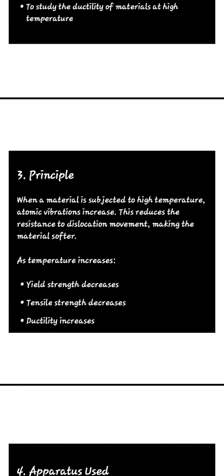Principle of hot tensile testing. When a material is subjected to high temperature, atomic vibration increases. This reduces the resistance to dislocation movement, making the material soft. As temperature increases, yield strength decreases, tensile strength decreases, and ductility increases.